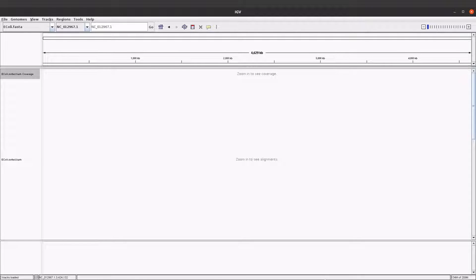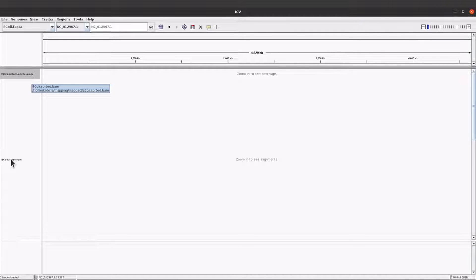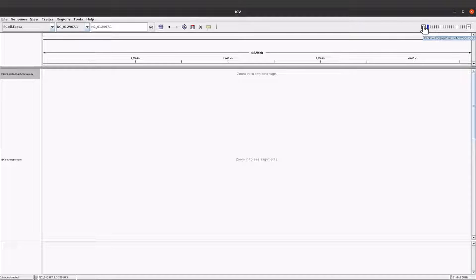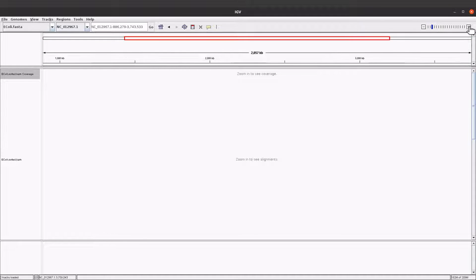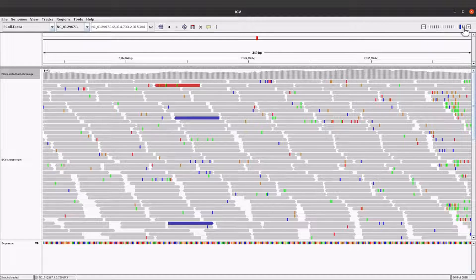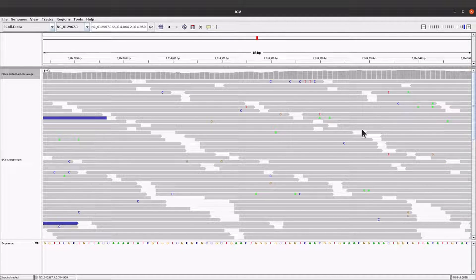The BAM file has been opened. If the BAM file is opened you will see the name on the left side. We have the name of the BAM file, then coverage, and on the other side you also see the name of the BAM file. You may see a blank window - this is the default behavior of IGV. You have to zoom in to see the alignment. To zoom in, come to the top right - you'll see two buttons, minus and plus. By default the alignments are zoomed out completely, so use the plus button, or click and drag the blue bar to the right. The alignment will zoom in for you.